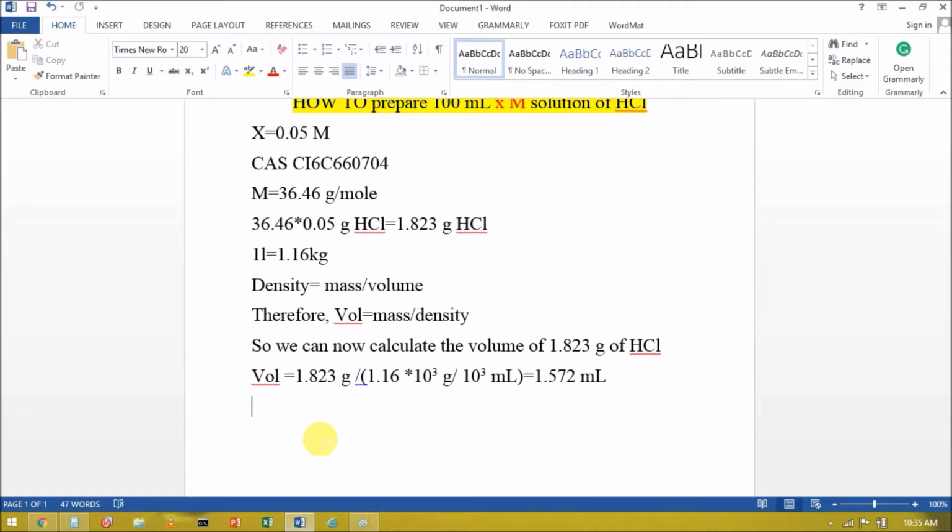In my case, the purity is 35%. It generally ranges from 35% to 37% in common cases. So you need to take it into account, otherwise we will end up calculating a wrong figure. So how to incorporate it?